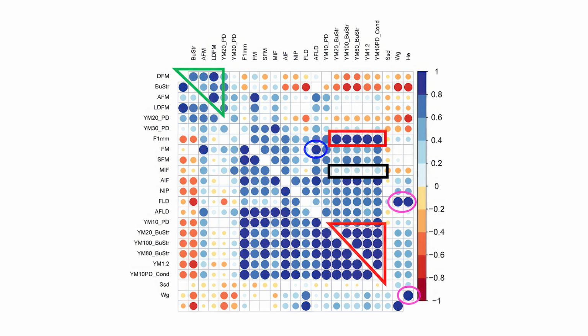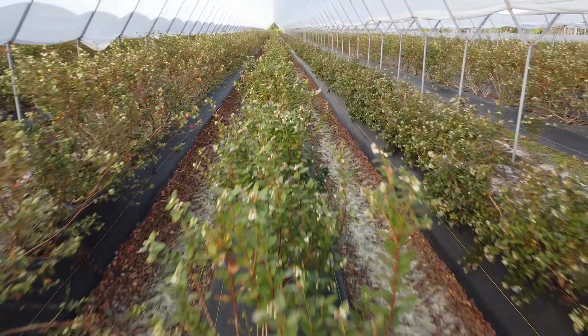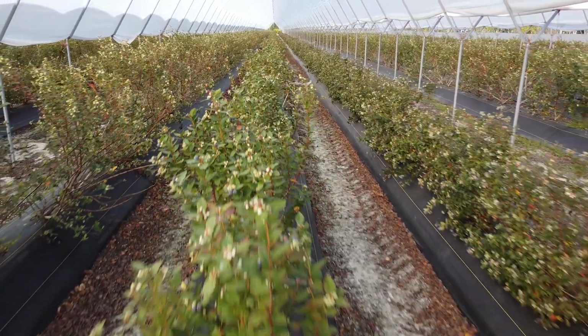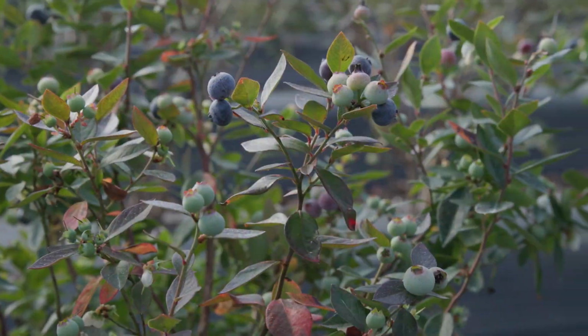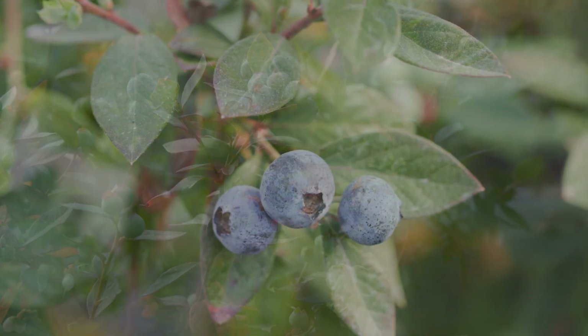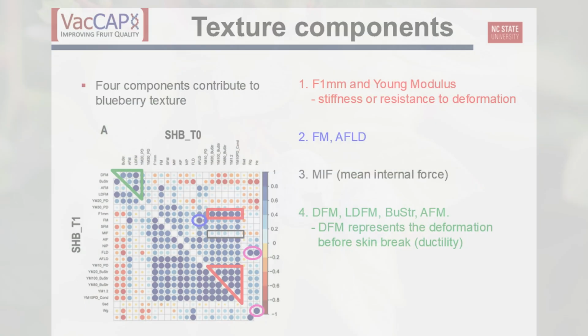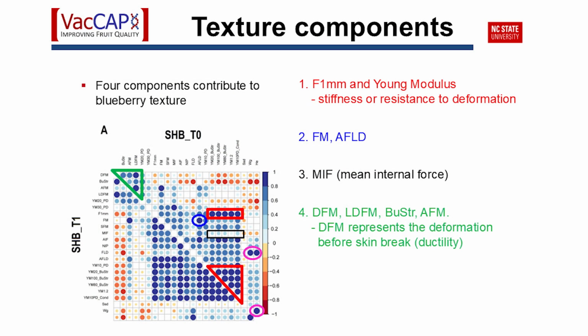Like the sensorial firmness that you feel in your mouth, or how the texture changes during storage, and so on. Depending on the program and number of seedlings to evaluate each year, if it's not high throughput enough for early stage selection, this could be used at advanced selection stages as well.